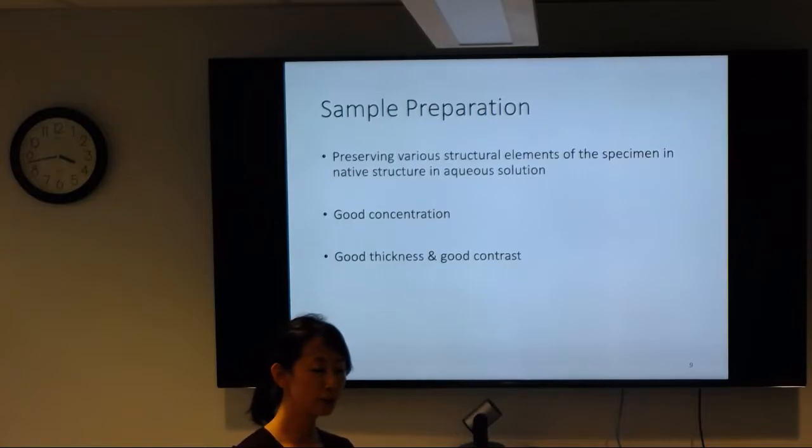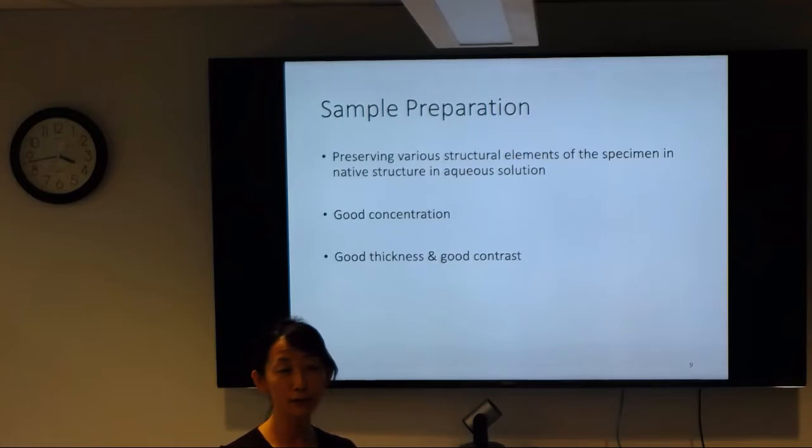So we're gonna go to the sample preparation aspect. I will try to go through this really quickly and only emphasize the parameters relevant to tomography application. For all sample preparation for Cryo-EM, we want to preserve samples in the native state, with no ice crystals, and still hydrated, so that we can preserve them at very low temperature and image them in very high vacuum in the microscope.